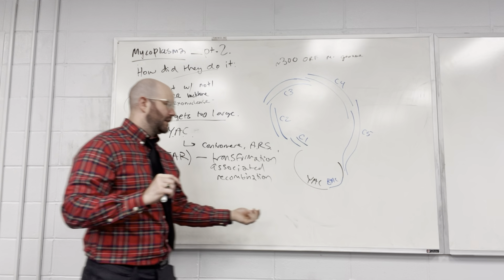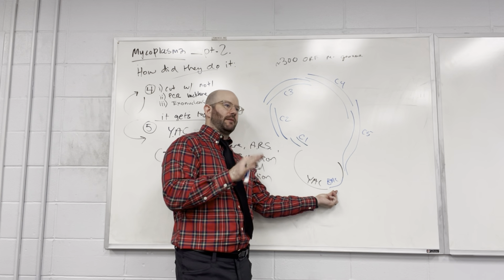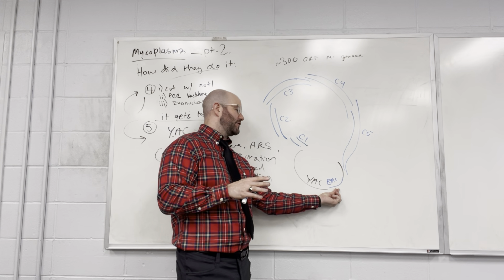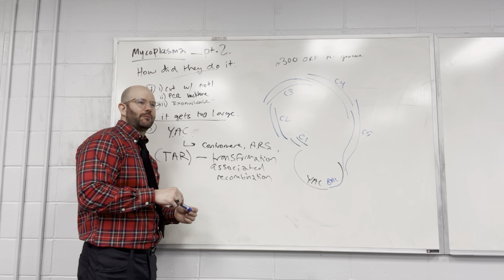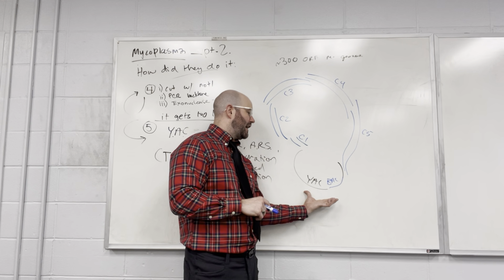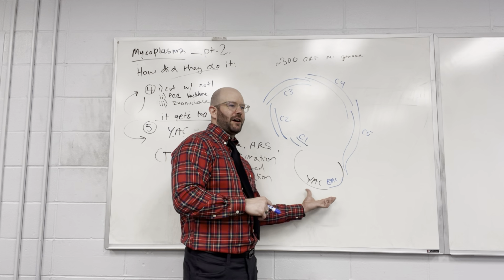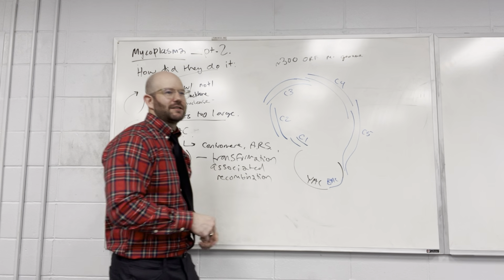I don't know if it can't survive in E. coli. It's probably that it wasn't assembled well in E. coli. But maybe that's just what the plasmid had. I don't know if they're ever transferring it back into E. coli after this point. But it would be a lot harder to just delete it. This is probably something they had in their database that worked, and so it's like, well, let's try with this. And it worked. As opposed to, let's delete this, if that makes sense.